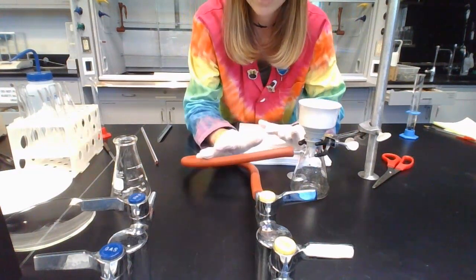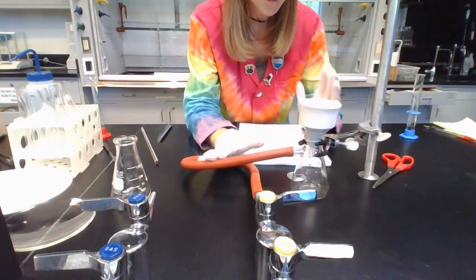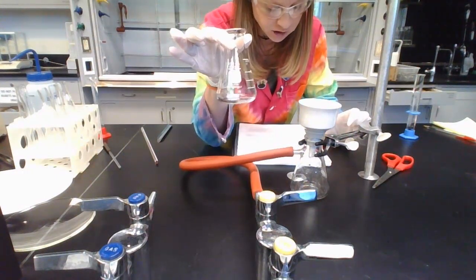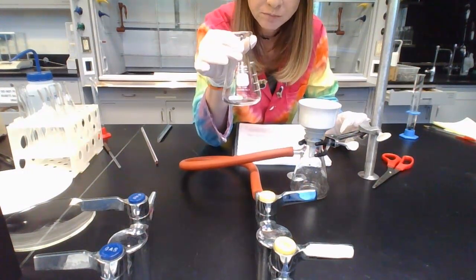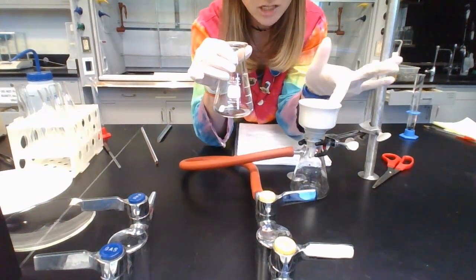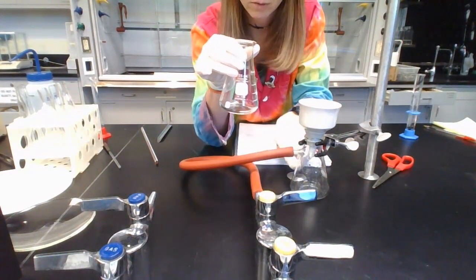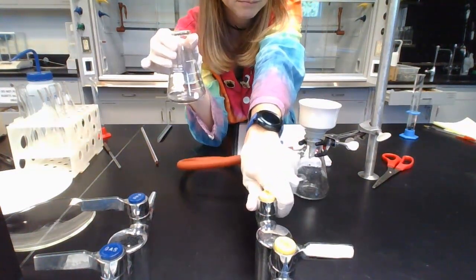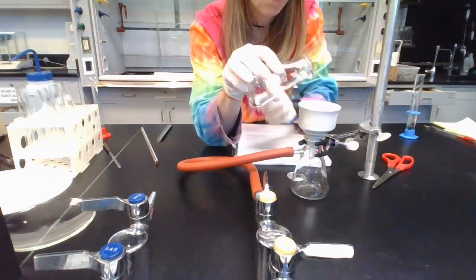Okay, so hopefully at this point you've got this all set up and it's been the 10 minutes of it sitting in the ice bath. So then you've got solid in here, right? This has got your aspirin solid in it. So what we're going to do is filter this. We need to pour this into here so the aspirin stays on top of the filter paper and the liquid goes down to the bottom. So you will then turn on this again, okay? And then you will pour whatever you can.